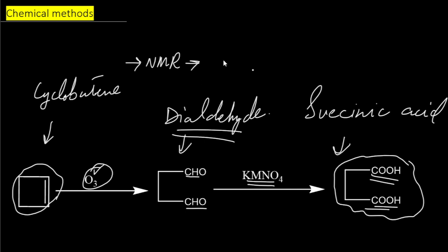Except for elucidating chemical structures, we can study dynamic processes by using NMR.